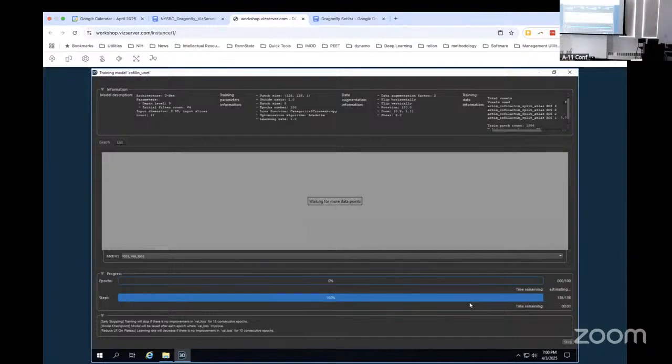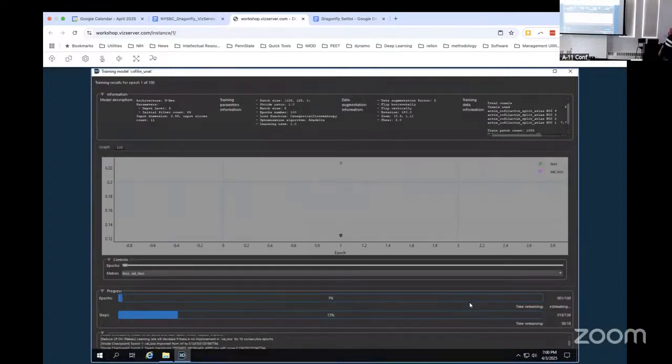So the input's the unlabeled and the output's labeled. Yes. I don't know why, but deep learning people are weird. They call them inputs and outputs. The output is the thing you're trying to achieve. That's why they call it the output. I think they should call it ground truth or whatever you want, but it's the goal.